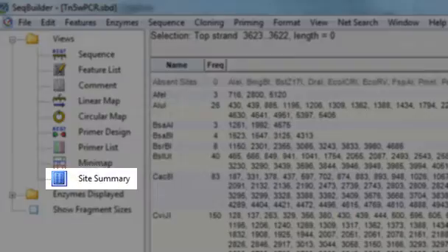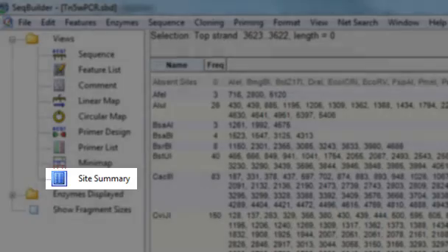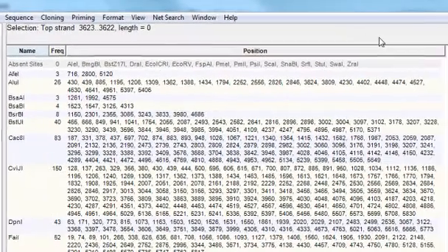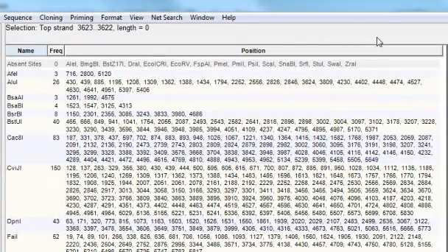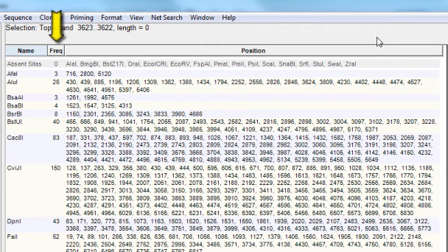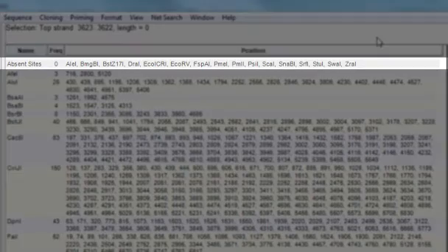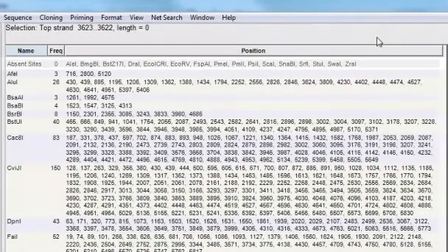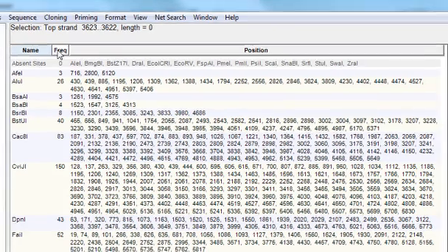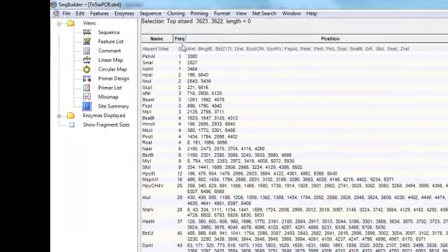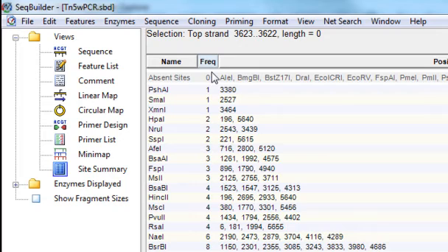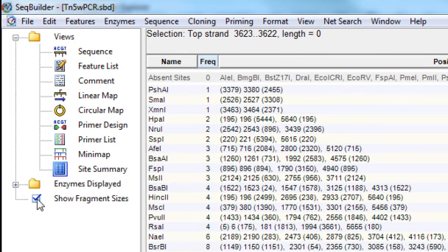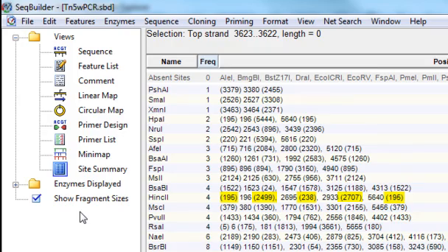The site summary view displays a table of the currently displayed restriction enzymes and their cut sites on your nucleotide sequence. As you can see, for each enzyme, the frequency of cut sites as well as the position of each cut site is listed. Absence sites are always listed together at the top of the list. You can sort this table by clicking on any of the column headers. And if you'd like to see the length of the fragment between cut sites, you can select Show Fragment Sizes here in the curtain. And the fragment length is then displayed after each position in parentheses.